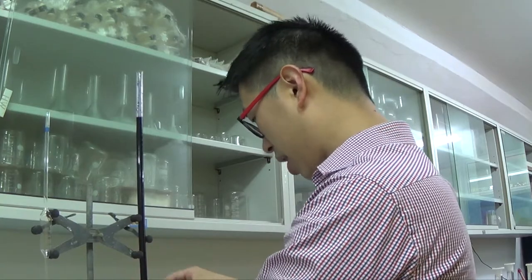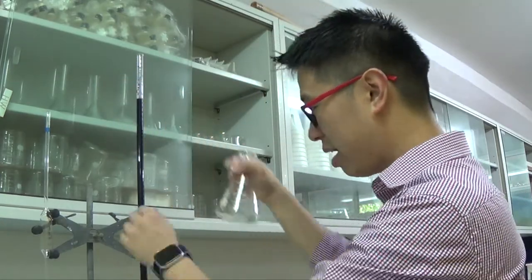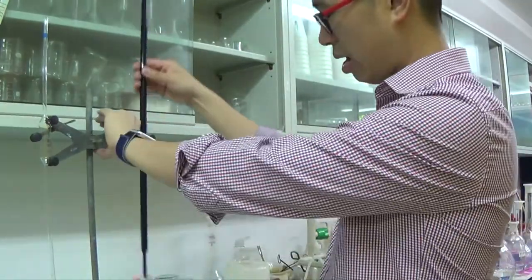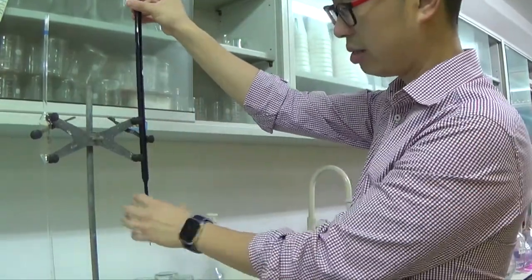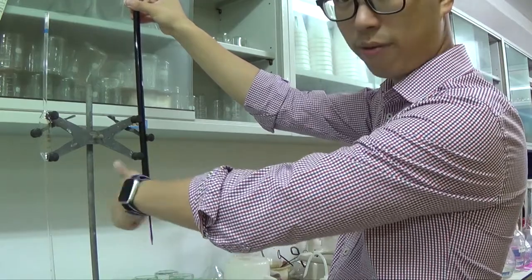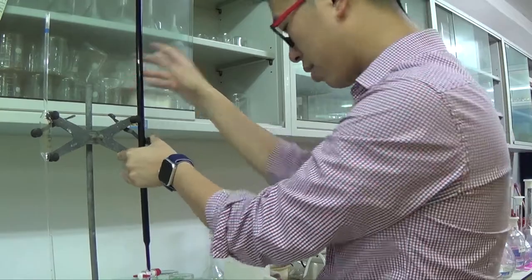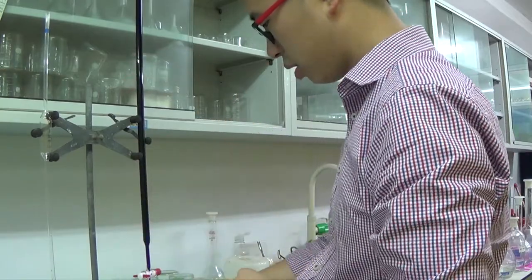Okay, so I am right-handed, so I'll hold the conical flask in my right hand, and I will twist the burette to the other side so that my left hand controls the valve, okay? So remember that you can twist these things around here, okay? So this is a rough titration.